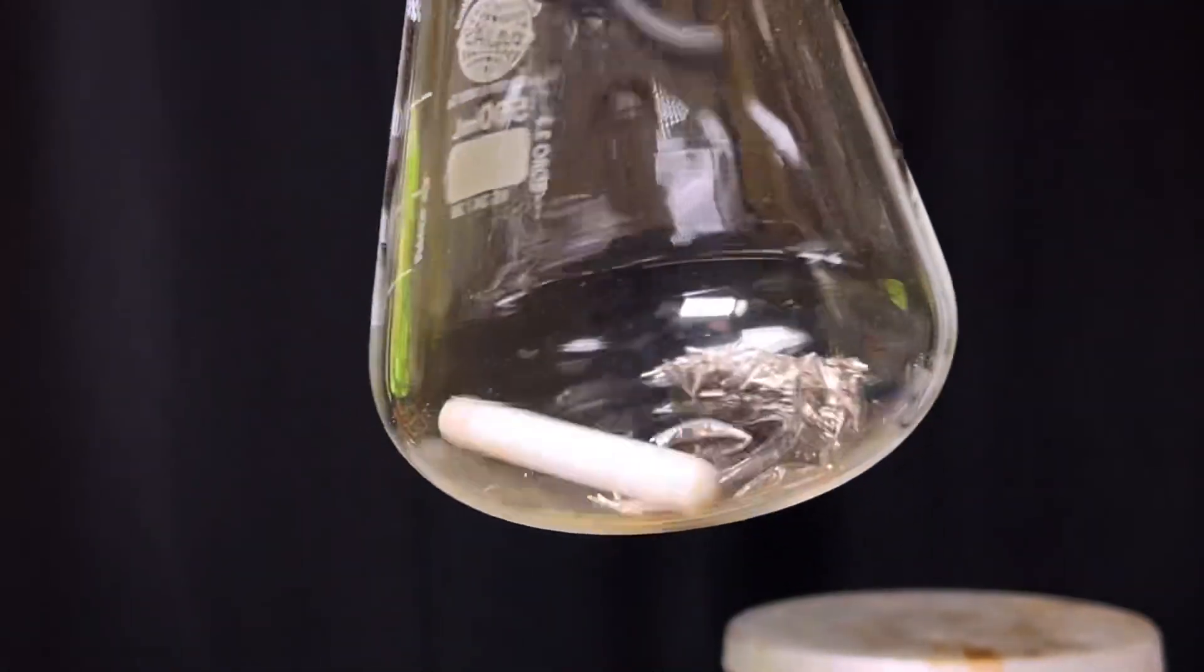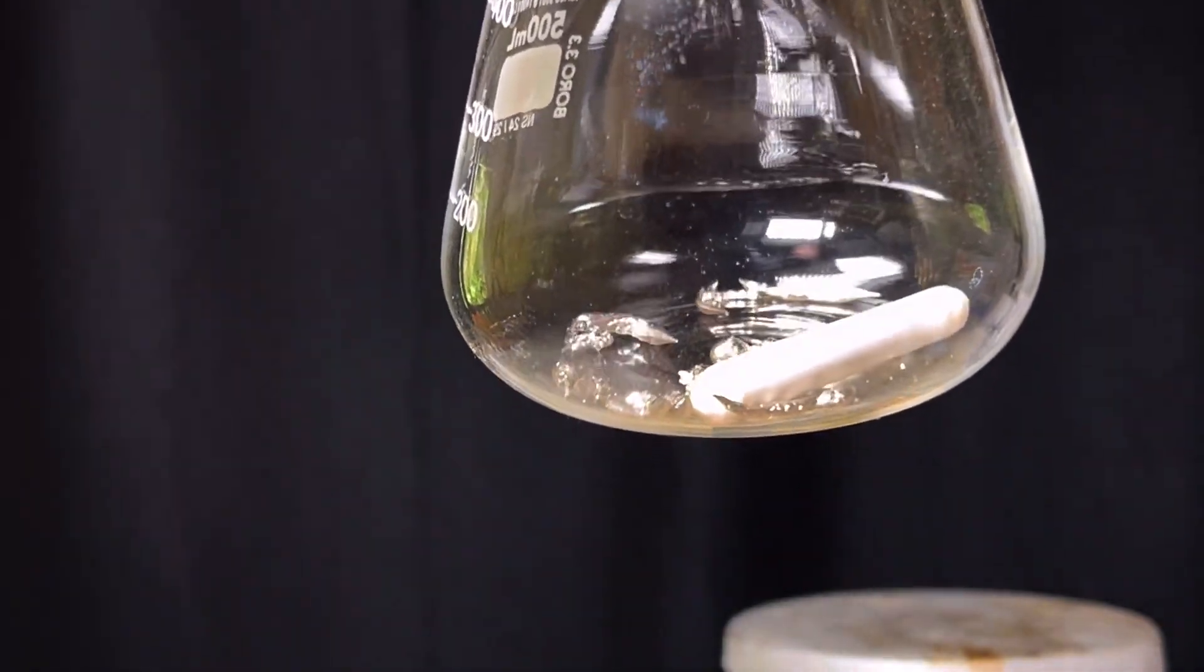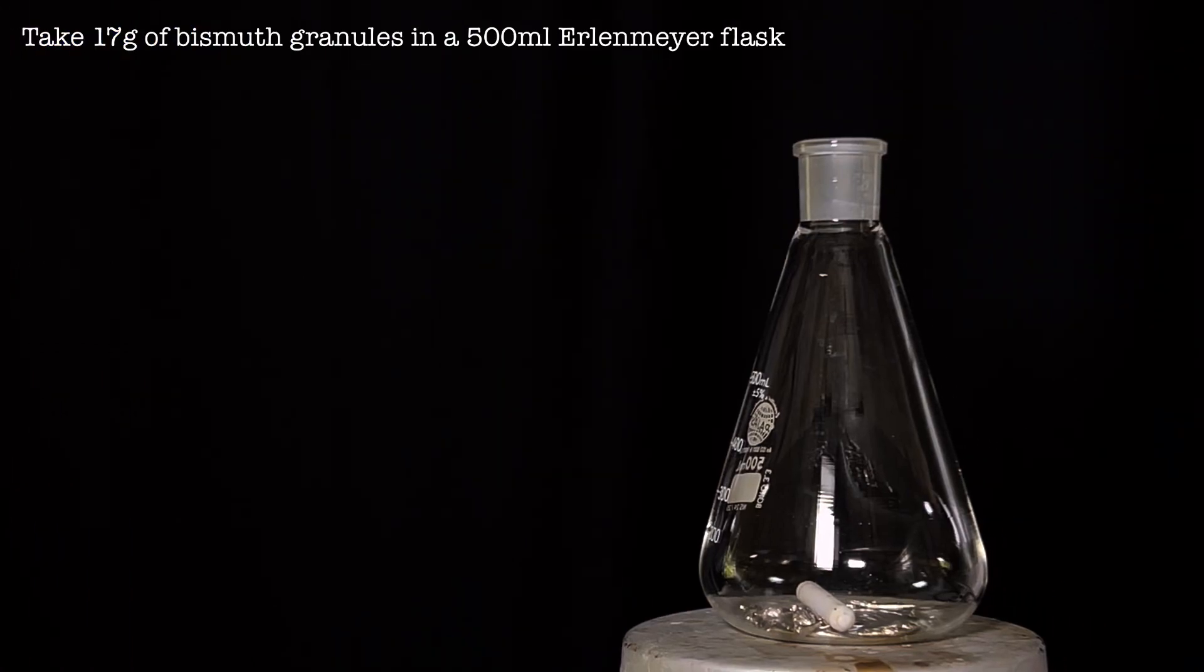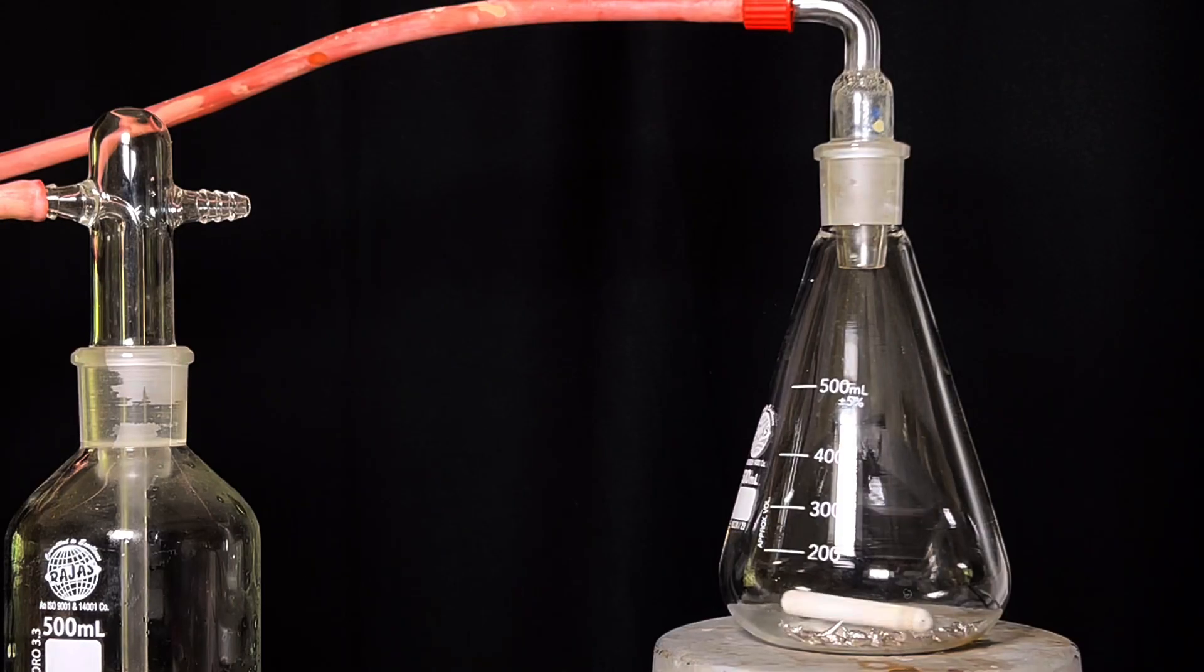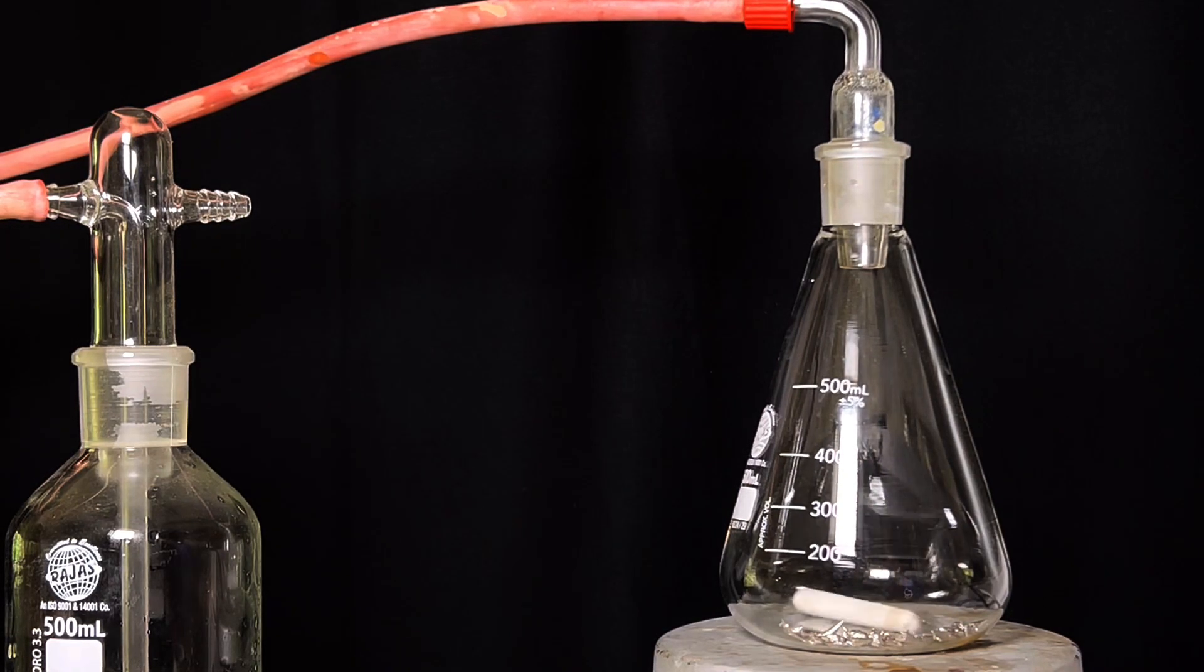Start by taking 17 grams of fresh bismuth metal in a 500 milliliter Erlenmeyer flask. A magnetic steering bar was also placed in the flask and the flask was placed in a hot plate stirrer. A rubber tubing was connected from the Erlenmeyer flask to a gas wash bottle. The gas wash bottle contains silica gel.